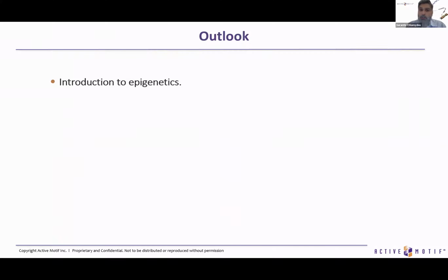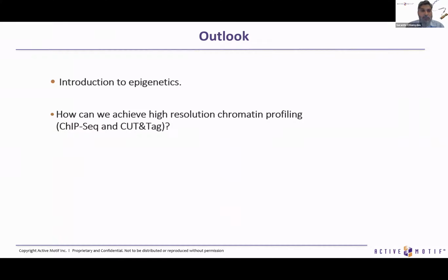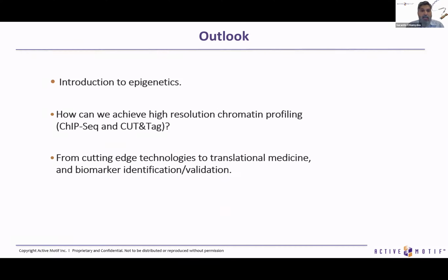Today, I will give you a short introduction about epigenetics. I will spend a little bit of time explaining ChIP-Seq, CUT&Tag, and how they can be combined in the context of epigenetics, and some examples of how you can apply the new technologies with the help of bioinformatic analysis in biomarker identification, validation, and translational medicine.